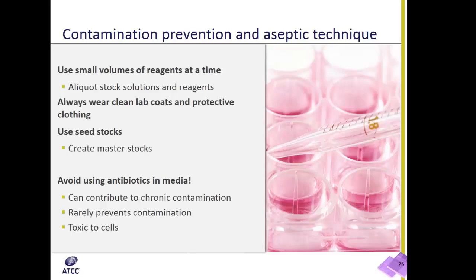It is advisable to bring small amounts of reagents into the hood at a time. If possible, you may want to aliquot small amounts in containers to reduce the number of times you bring a possibly contaminated object into the hood. For instance, if a vial is already contaminated, at least you won't be bringing it time after time into the workspace. Always remember to wear clean lab coats that cover most of your arms to prevent dust and shedding skin from contaminating your cultures. We mentioned this before.